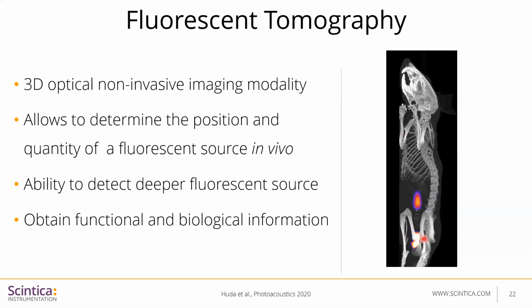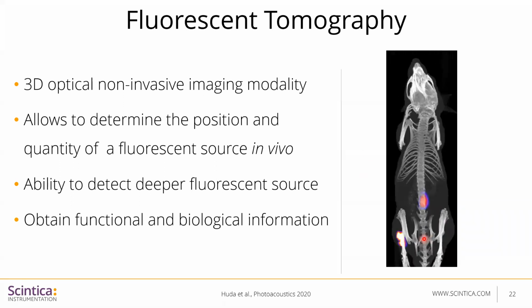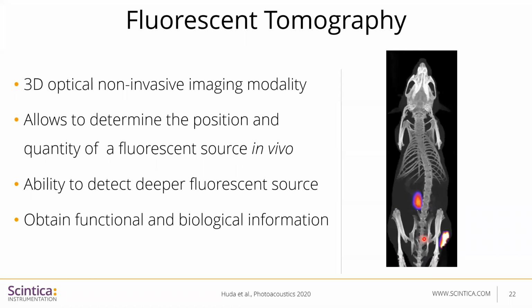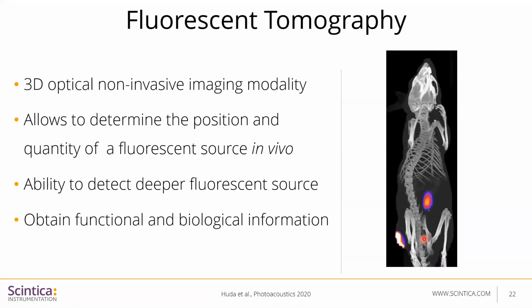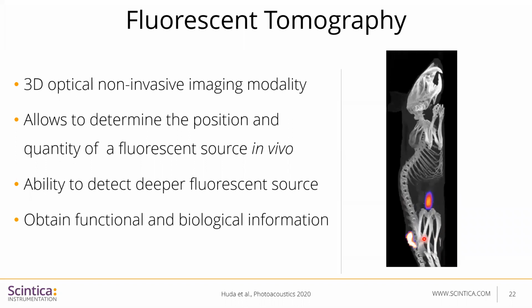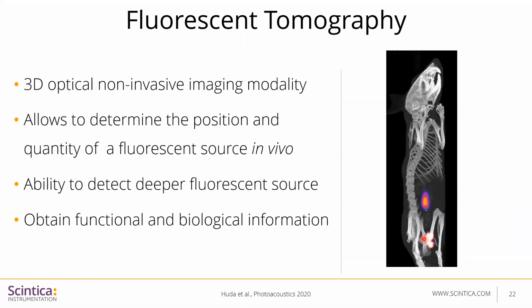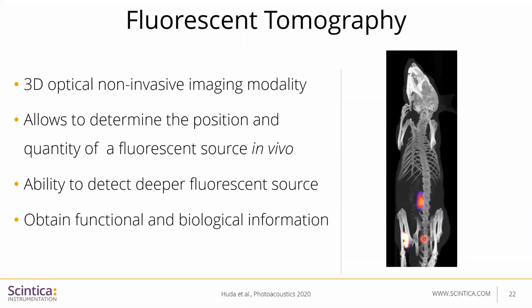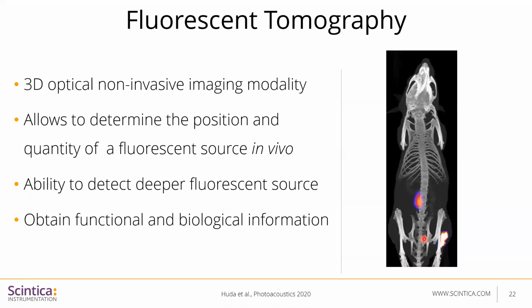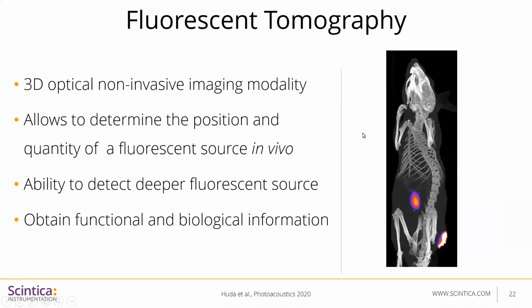The image on your right is one of the images captured using fluorescence tomography. This imaging modality allows us to determine the position and the quantity of a fluorescent source in vivo. It also gives the ability to detect deeper fluorescent sources and can be used to gain functional as well as biological information.